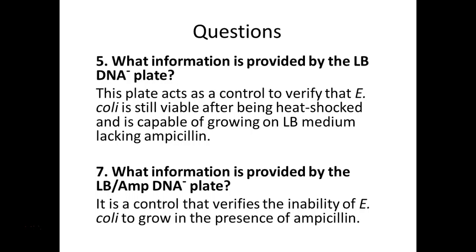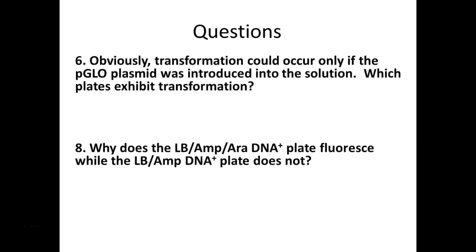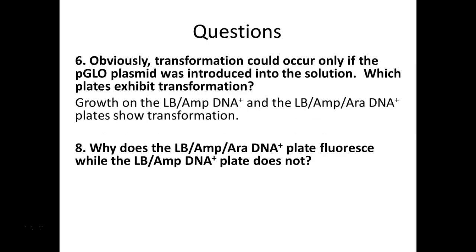Still with me? All right, now let's move on to our plus plates. So transformation can occur only if the pGlo plasmid was introduced into the solution. Which plates are going to show transformation? These are our DNA plus plates, right? But we have 2 of them.